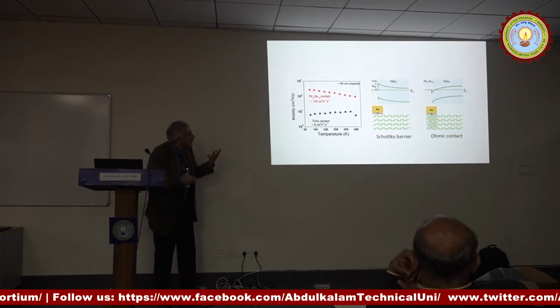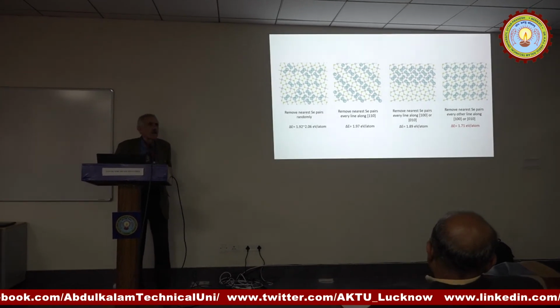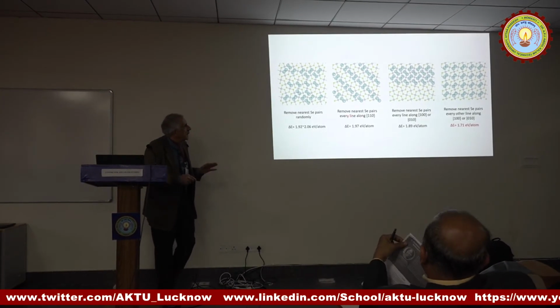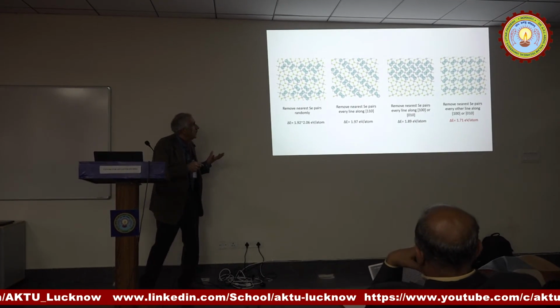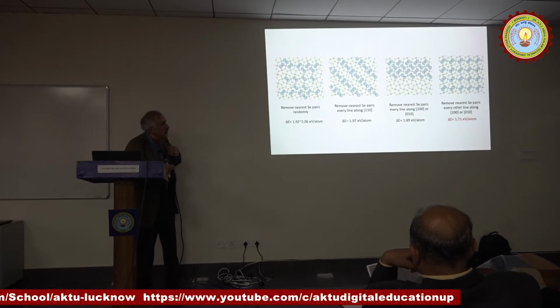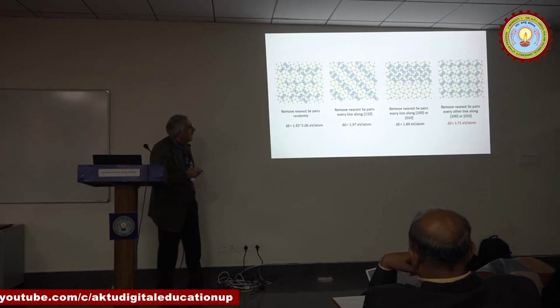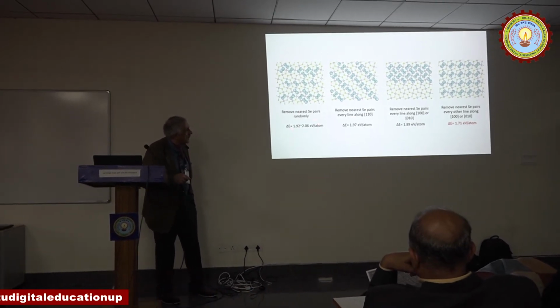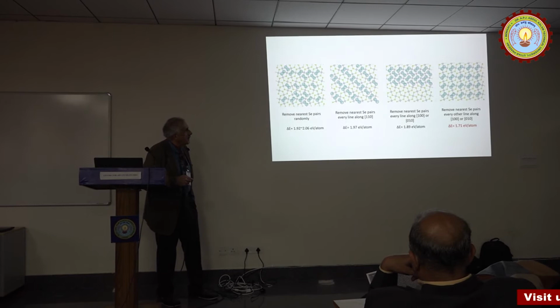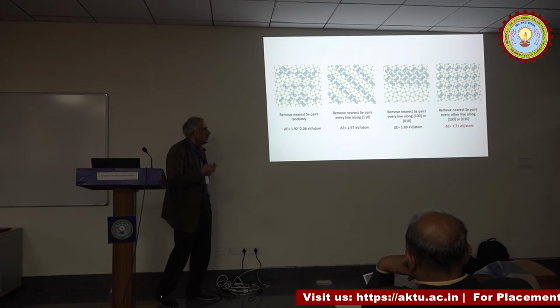So we looked at it to find out how does this transformation occur, and why do you stop at Pd17Se15 and don't keep going and lose more selenium? And we looked at how you can remove selenium atoms to get from the PdSe2 layer to the bulk Pd17Se15. And we tried a lot of different things, and we calculated the total energy difference, the cost of energy to remove this, and therefore you are going to remove the ones that cost the smallest amount of energy. That's what the beam will do.